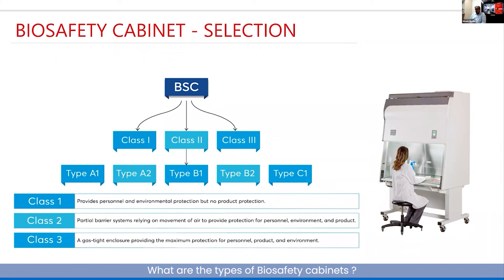Class 3 is an absolute gas-tight enclosure that protects people, the product, and the environment. These are recommended for use in BSL-3 environments based on risk assessment, and are definitely required in BSL-4 physical containment.